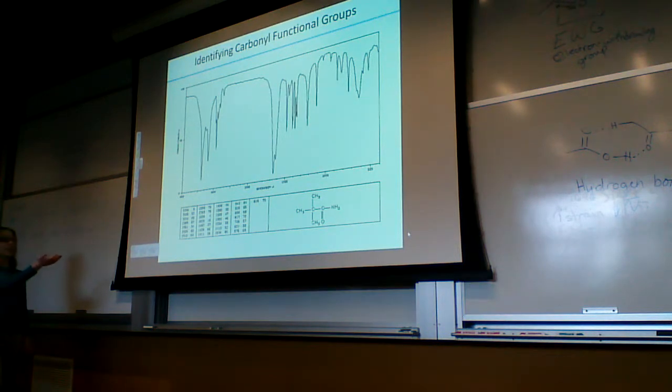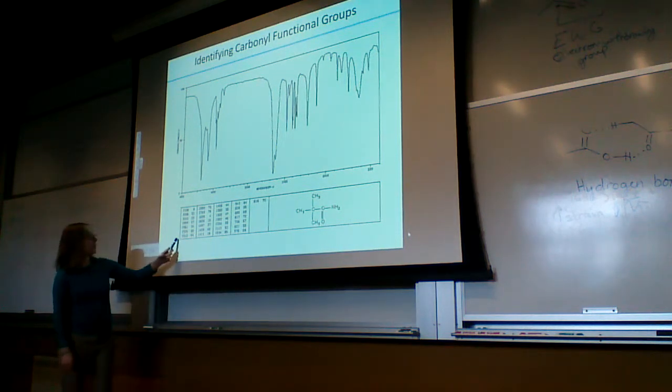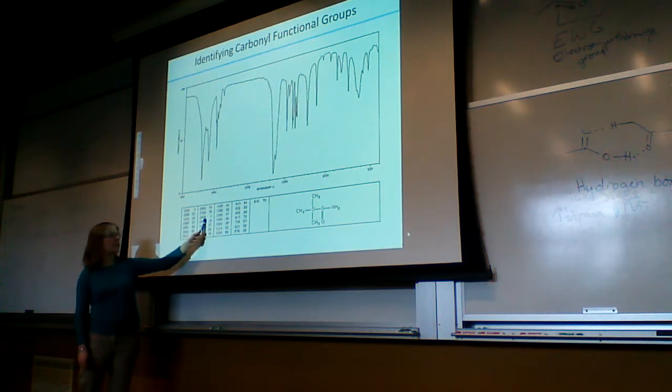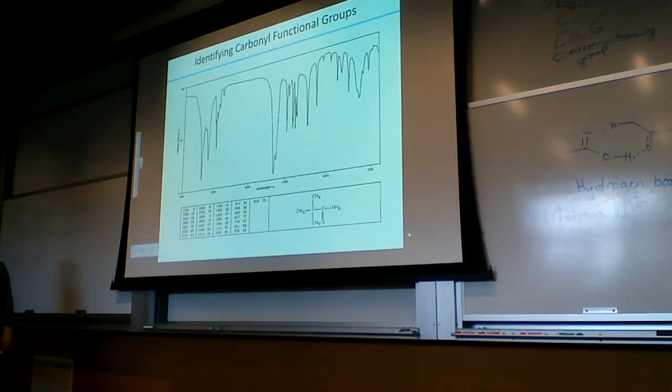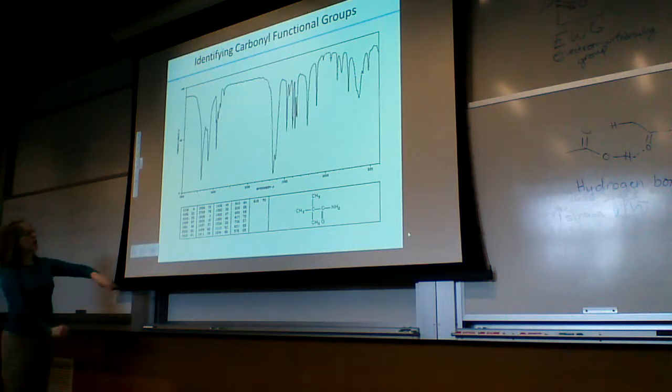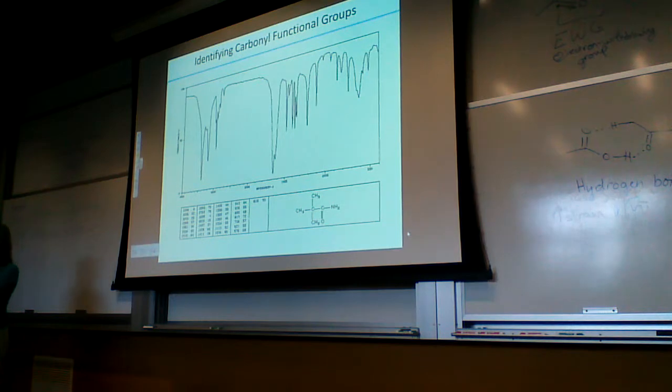But let's say we look at this one and we see the stretching frequency is at 1658 for our strongest one. It's a little bit low for the carbonyl region, but it is an amide, and for amides, 1690 is kind of our base value. This is shifted a little bit more, probably by hydrogen bonding within or between different amide molecules. And when you look at the NH or OH region, we see two peaks. So that can lean us towards having an amide.